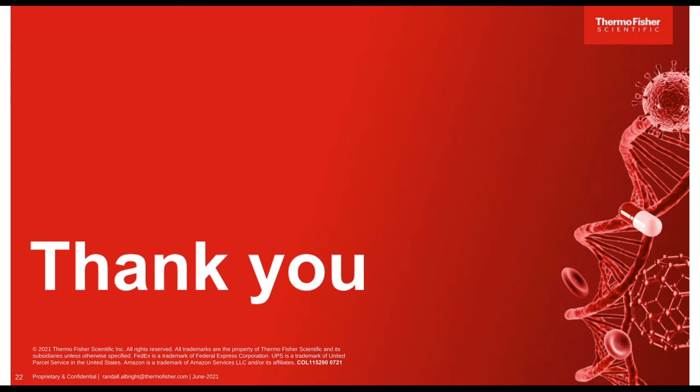Yes, thank you. How much time can I save by having the manufacturer of record perform the qualification versus using in-house resources? Great question. I don't have statistics on this, but the length of time to develop a qualification protocol would be dependent on the complexity of the system. Having a manufacturer qualify allows quality systems to focus on the risk tolerance of the workflow, making the equipment qualification more plug and play to the validation process. So having the manufacturer perform the validation in the long run is the better idea.